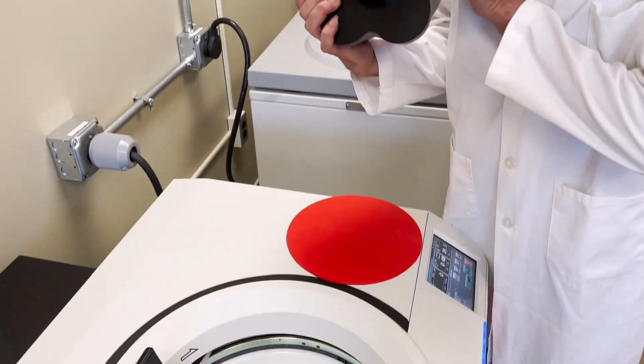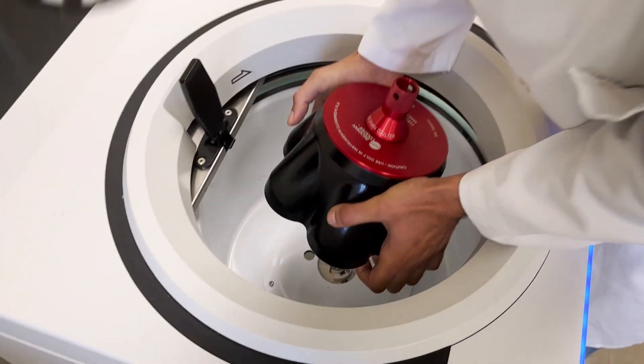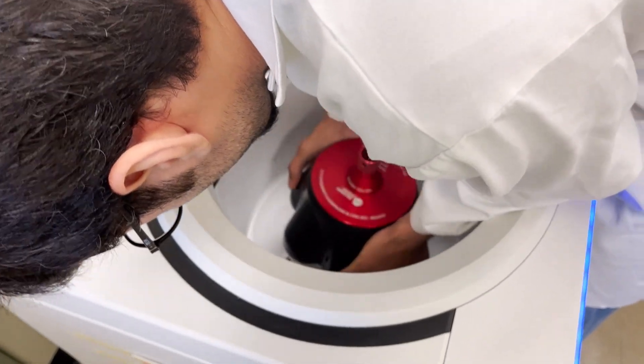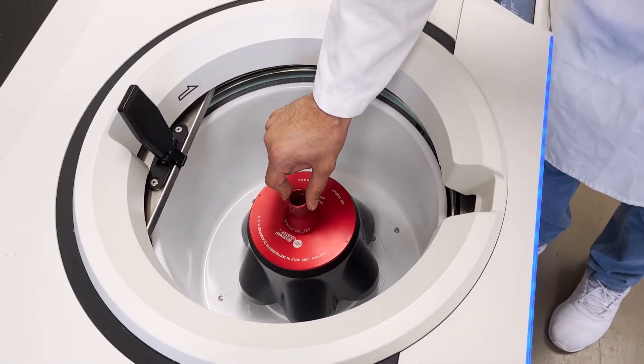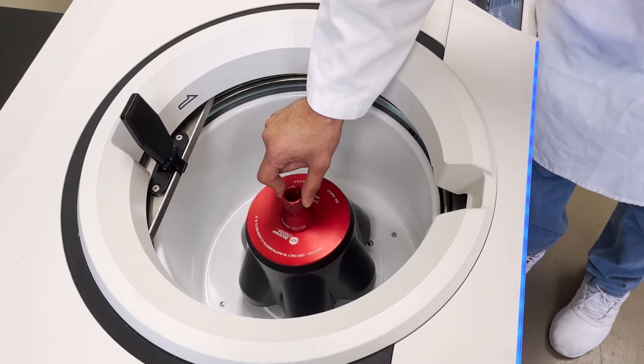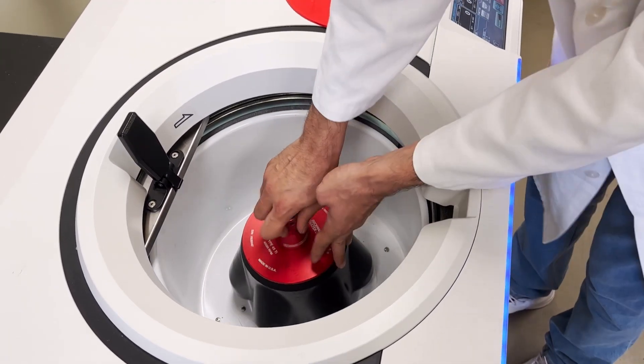The first thing we do is make sure the vacuum is off so we can open the lid. Then we take the rotor — there is a hole here, just be careful, this one is a little bit heavy. You place it here; some rotors are fixed and some rotate freely, but it just helps it to rotate.